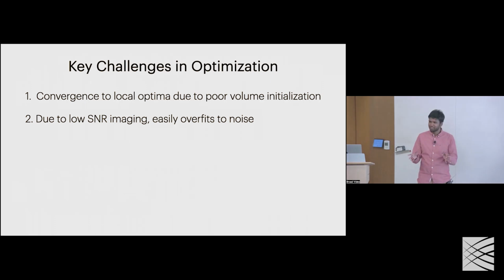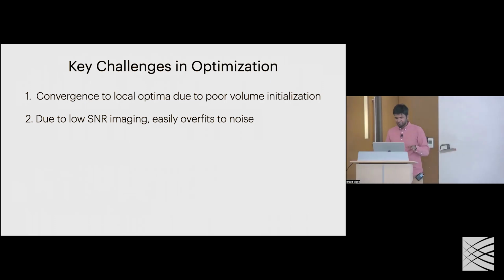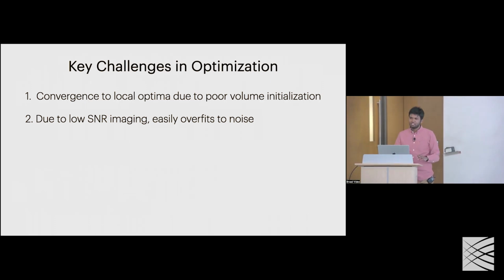It's not even specific to cryo. This is a general way of formulating any sort of tomographic reconstruction problem. Specifically in cryo, there are some remaining challenges which prevent that procedure from being effective. One property of the expectation maximization algorithm is that it always improves the likelihood, but that also means that it will probably get stuck in a local optimum unless you initialize it properly.